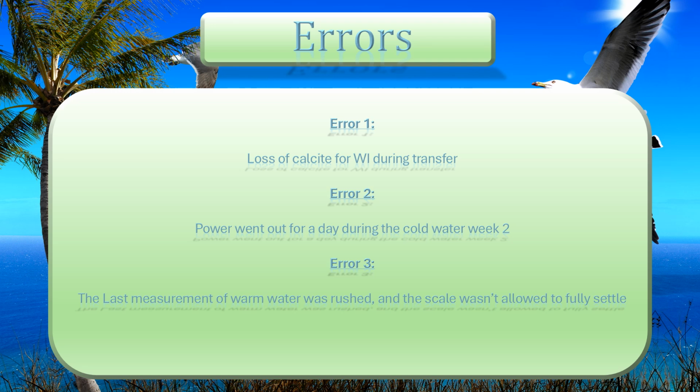Error 3, the last measurement of all the warm waters was rushed. Unfortunately, I did have to rush it, so the scale wasn't allowed to fully settle, so it might have been a little skewed off that. So next time I would just make sure to give myself a bunch of extra time.